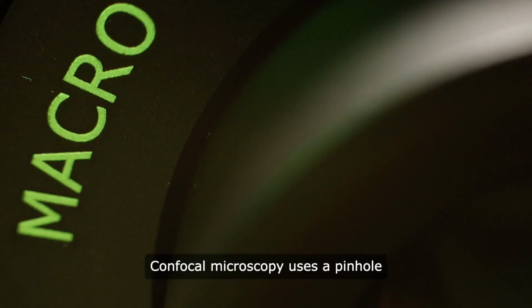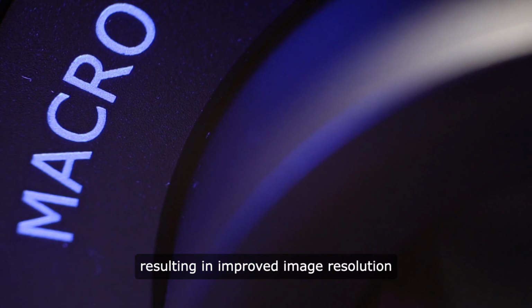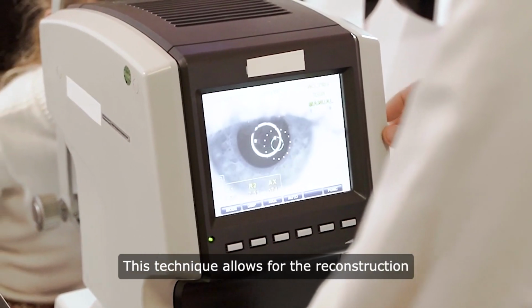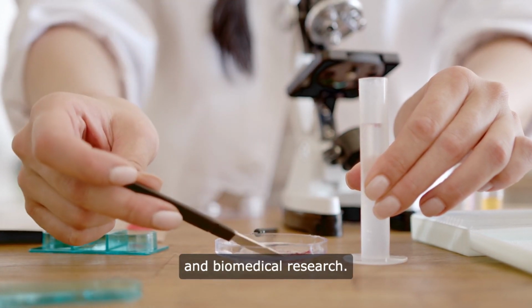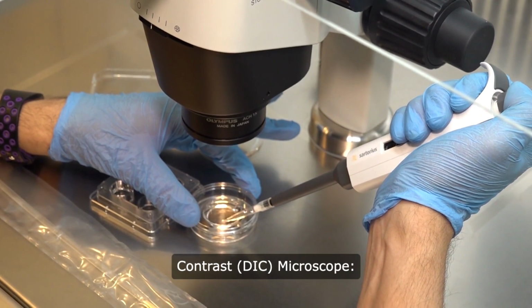Confocal microscope. Confocal microscopy uses a pinhole aperture to eliminate out-of-focus light, resulting in improved image resolution and optical sectioning capabilities. This technique allows for the reconstruction of three-dimensional images of thick specimens and is widely used in biological and biomedical research. Differential interference contrast (DIC) microscope.